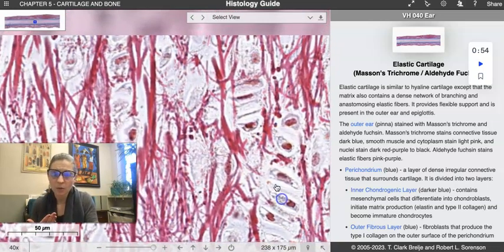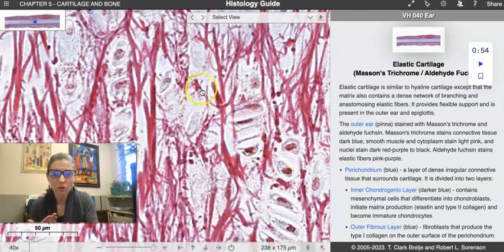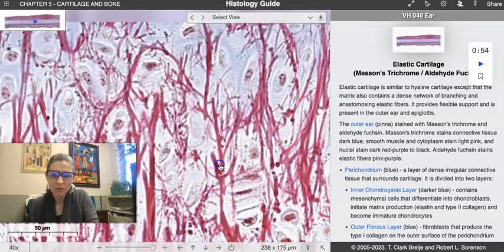And so you might come across, like here are two spaces, and there's a little bit of cytoplasm. You're like, oh, there's no nuclei. Well, don't worry about the fact that there's not a nuclei. It's probably on this side of the screen or through the screen. It's somewhere in there. We just don't get to see every single cell membrane and every single nuclei, right? There's different ways that we cut these tissues, or things that we just don't get to see. The lacunae, again, is going to be around the outer surface of that cell.